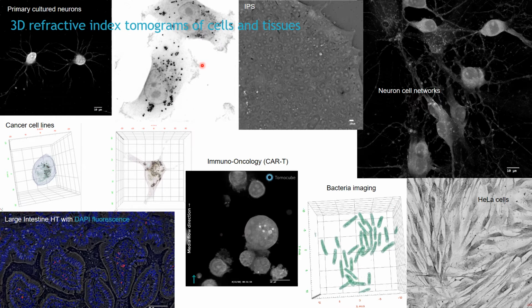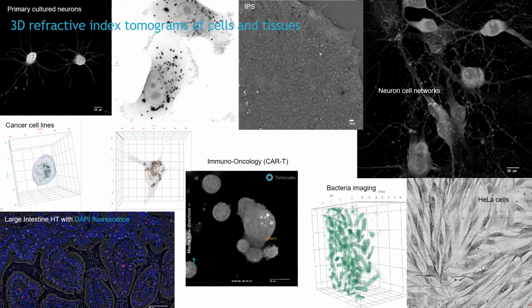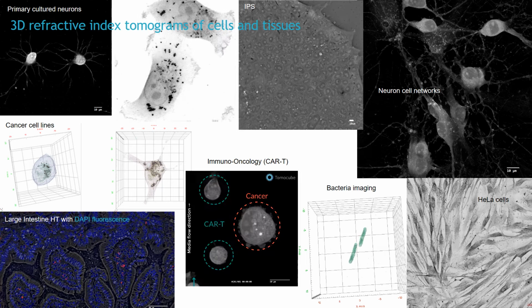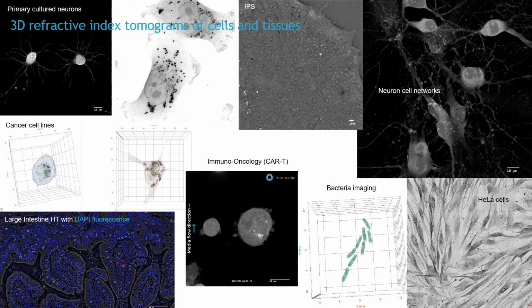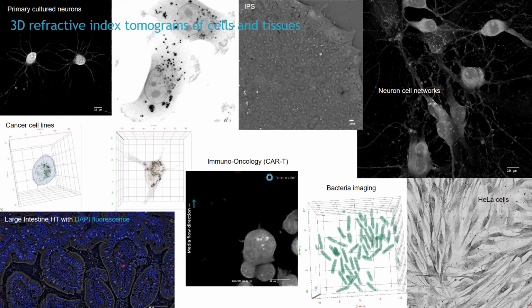Unlike the conventional fluorescence microscope, if you introduce fluorescence dyes and staining, you have to worry about if the cells are alive or not, or if they are not healthy anymore, and you have to discard the sample or images after so and so many acquisitions. Then you have to stain the samples again for other measurements.